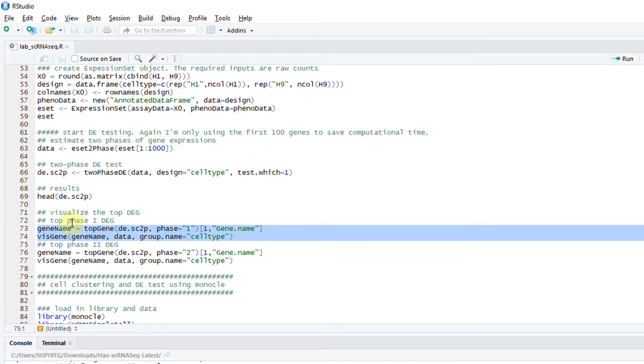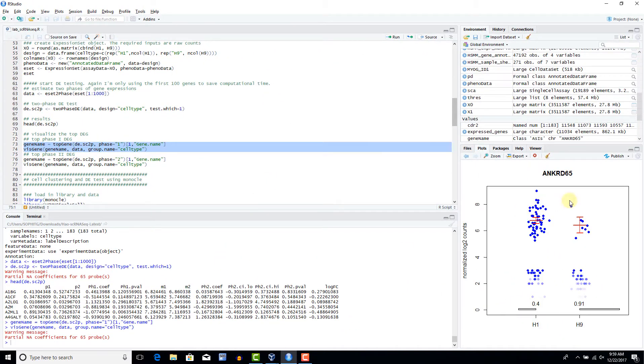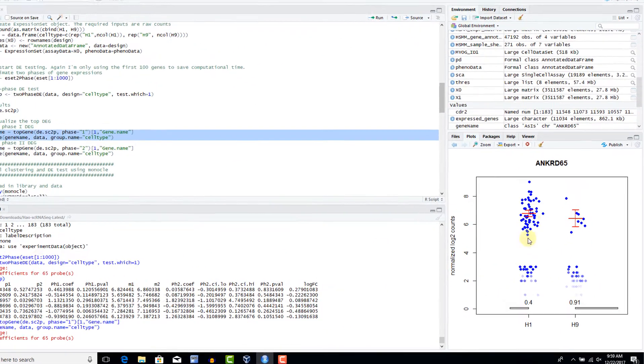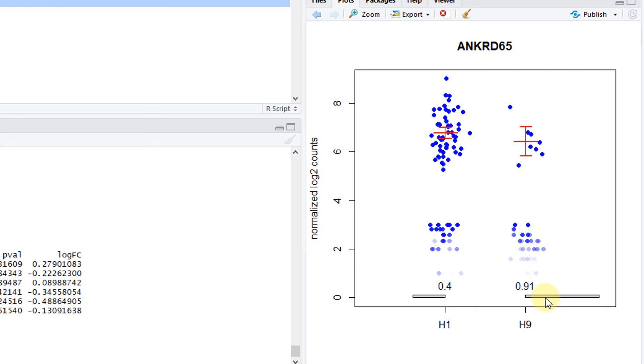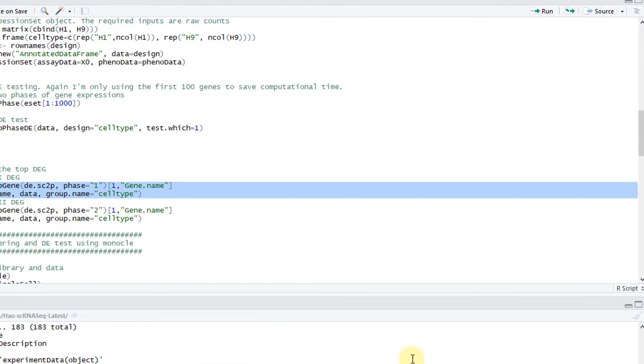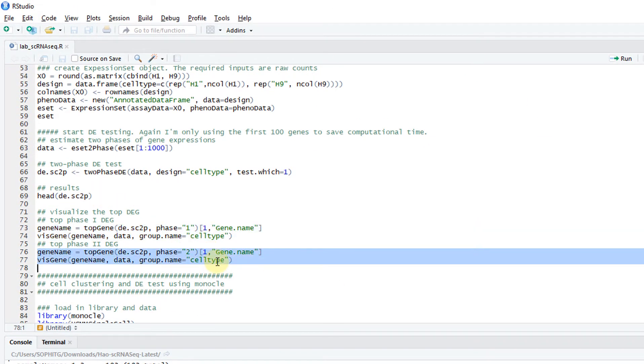We can visualize the genes. This is a top phase one DE gene. Phase one means the percentage of turning on. Here this shows in H1, 40% of the genes are off, so 60% are on. But in H9, 91% of the genes are off. There's a huge difference in the percentage of genes being expressed. We call this the phase one DE gene.